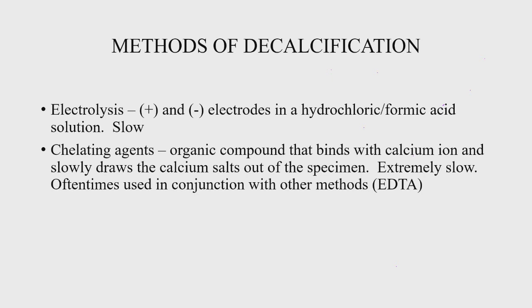This is extremely slow, and typically chelating agents by themselves are not practical for routine histology. But many times it's used as a buffer or a softening agent for a more aggressive decalcifying agent.